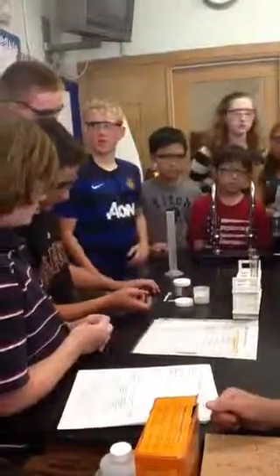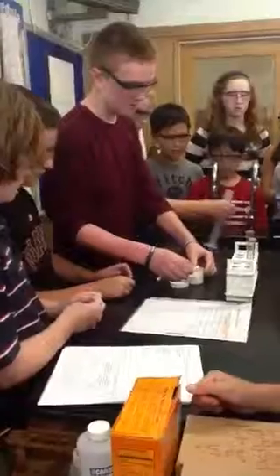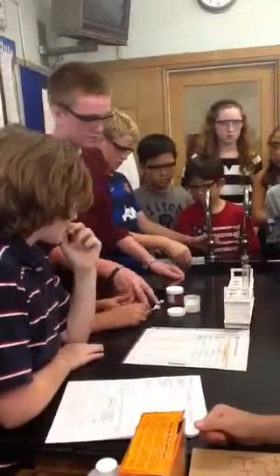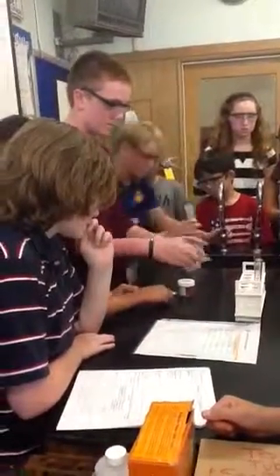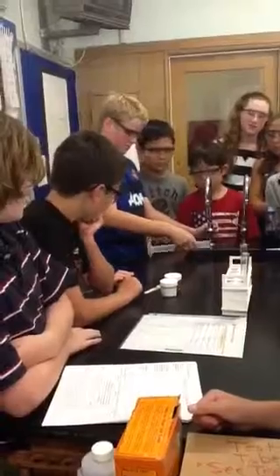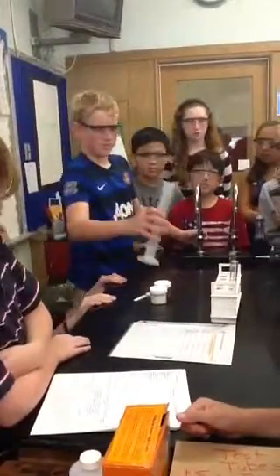And as you can see, it turns into a transparent red mixture. Okay, measure out 10 again, so we can save a little time. You can close it up. Okay, and we pour our water in. Is it pretty good? Yeah, it's good. Okay, good.